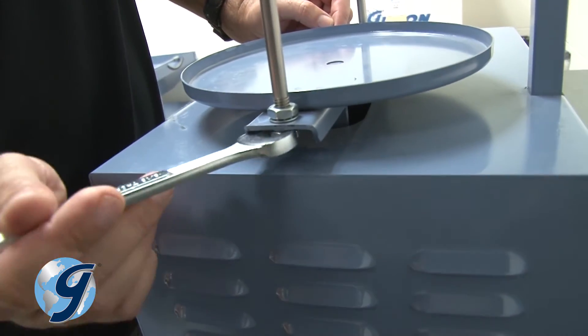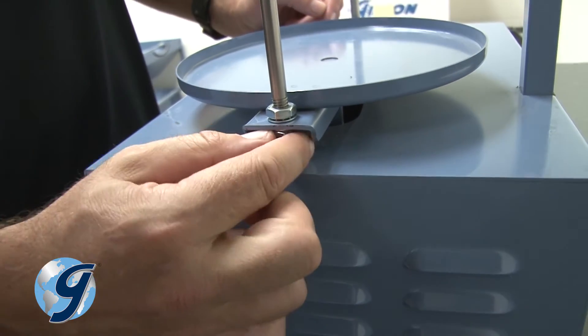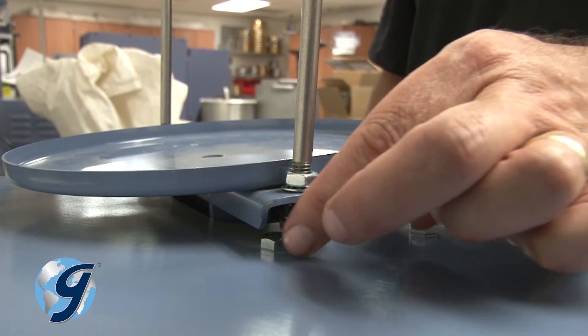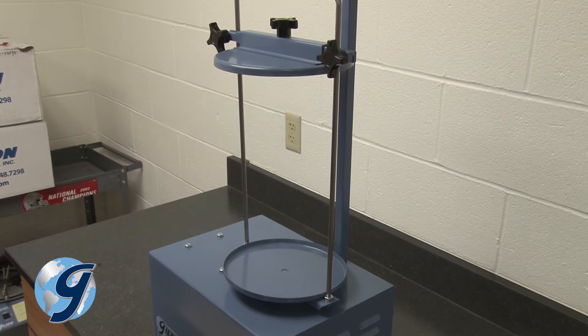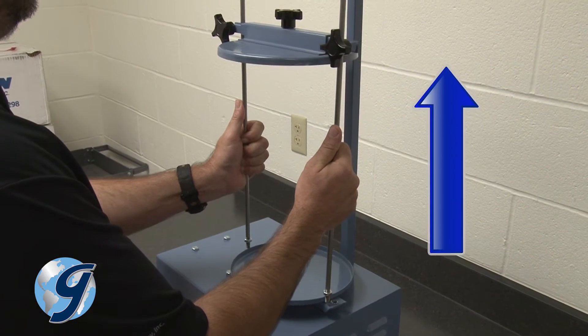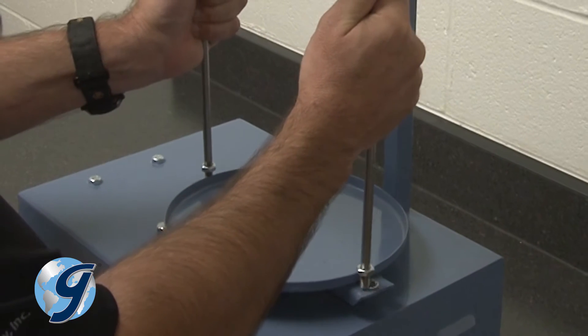Remove the two hex nuts and lock washers from both lower ends of the sieve retainer frame. Now grab both sides of the sieve retainer frame and pull both rods up and out of the lower sieve platform.